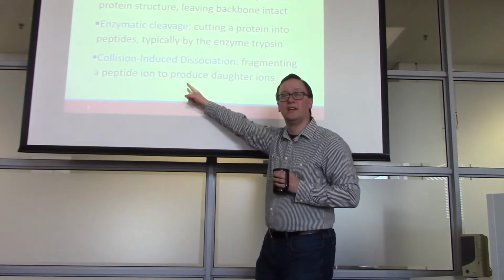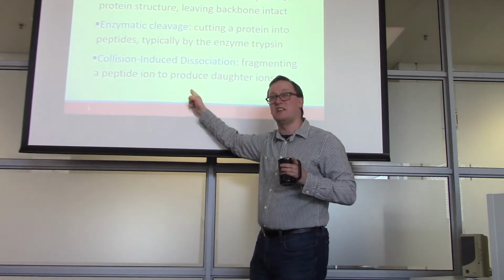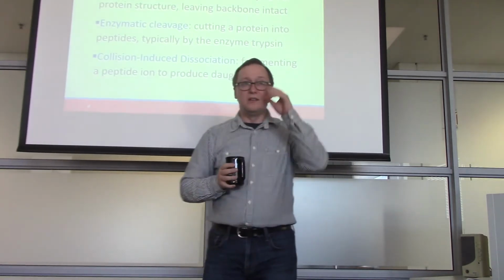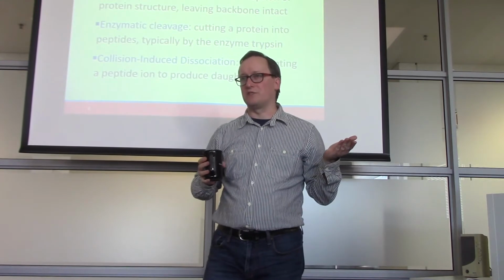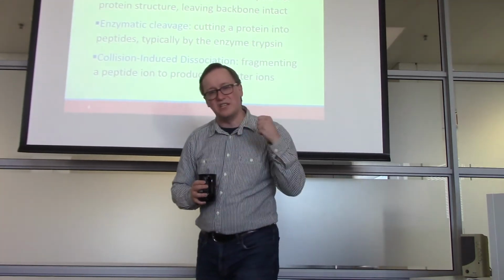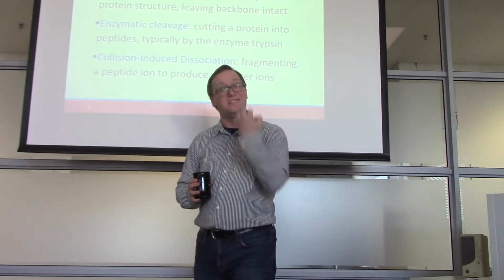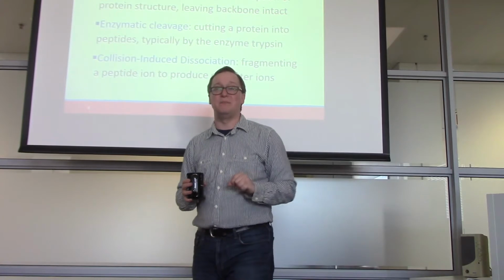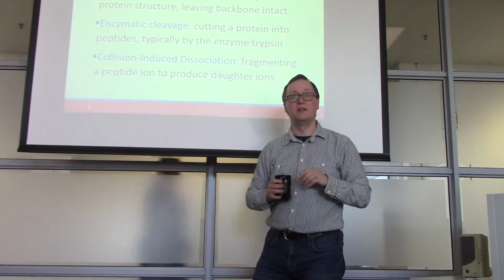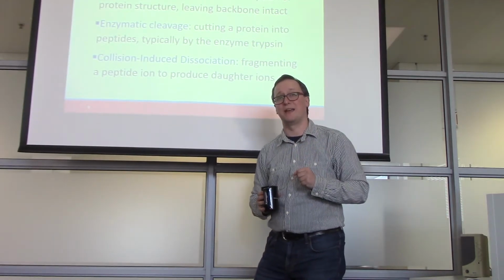All right, finally, the only one of these 3 steps that takes place inside the mass spectrometer is collision-induced dissociation. We frequently call it CID for obvious reasons, right? So essentially, if you can cause this peptide to absorb a bunch of energy, it dissipates it by breaking peptide bonds. And this collision-induced dissociation process produces fragments from the peptide ions that are inside the mass spec.